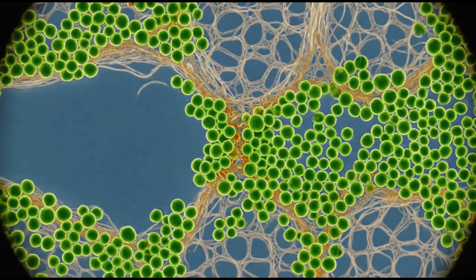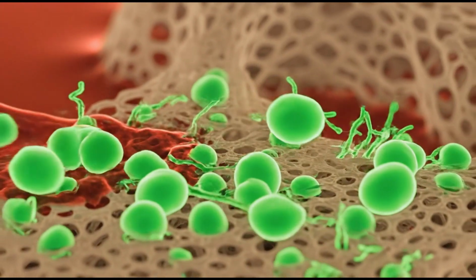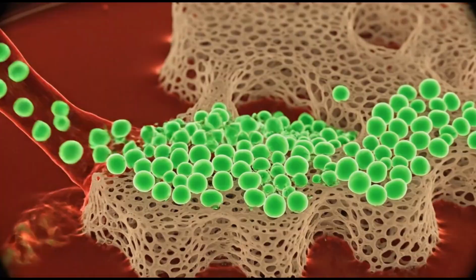Cells begin adhering to scaffold surfaces.